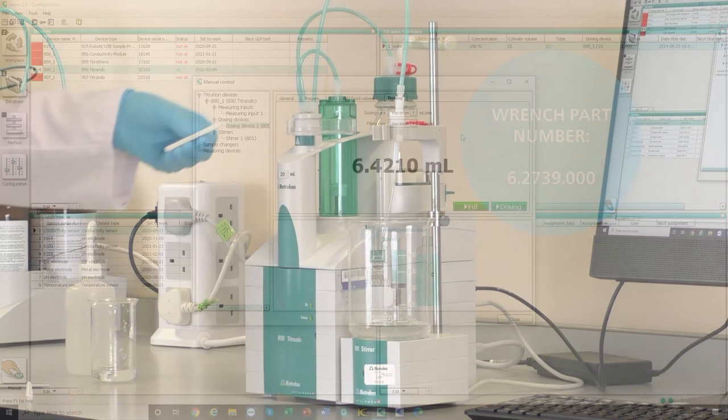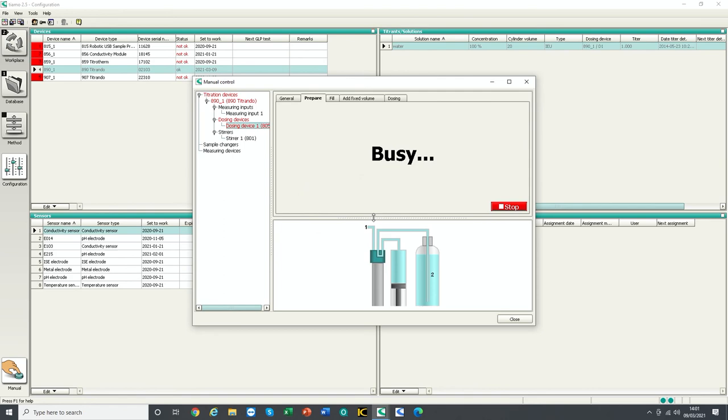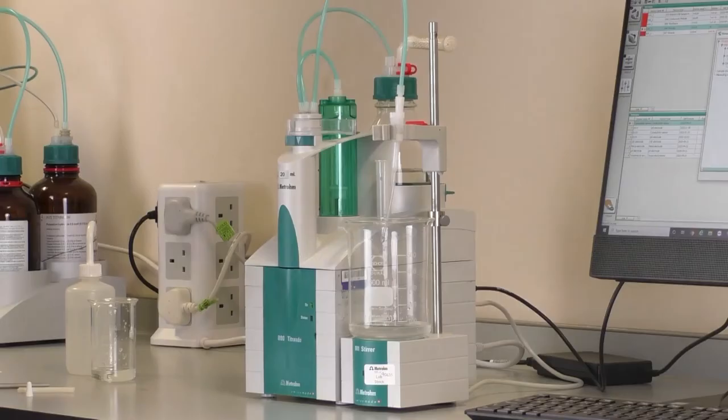Prepare the exchange unit in manual control, checking that all air bubbles are expelled from the system. Re-insert the piston rod.